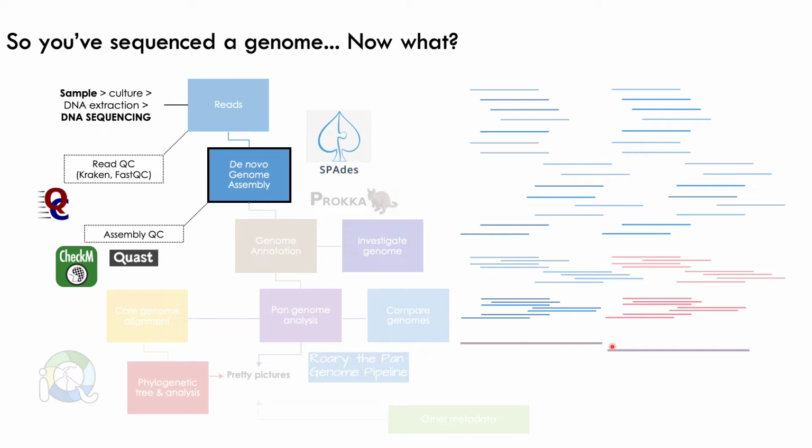So then we've got our two dark purple contigs and our one light purple contig. So these are our three contigs. For the purpose of this, we've just assembled a really lovely genome with one chromosome and two plasmids. This almost never happens. I just wanted to make a nice, neat example.